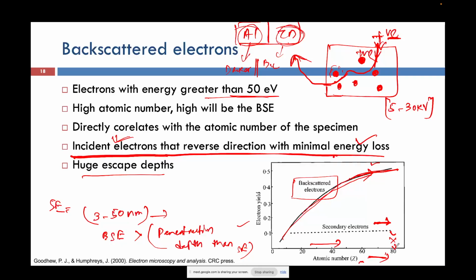It's like a simple X-ray analysis: if you take the same material to 2-3 different X-ray detectors, they will give you different intensity counts, right? There we are counting photons, here we are counting electrons. So it is based on how much the detector is able to capture the emerging electrons.